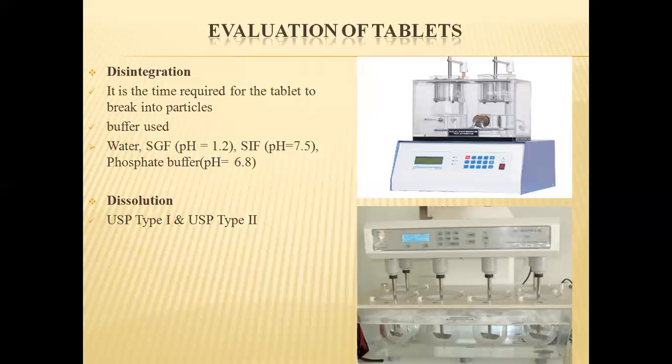Generally, disintegration time can vary from a few minutes to as long as 30 minutes for a conventional tablet. In case of enteric coated tablet and sustained release tablet, the disintegration time is longer than usual.